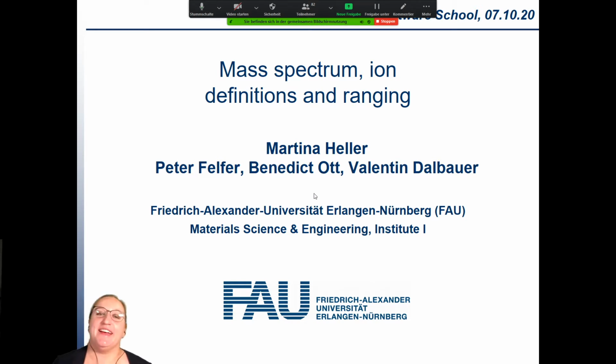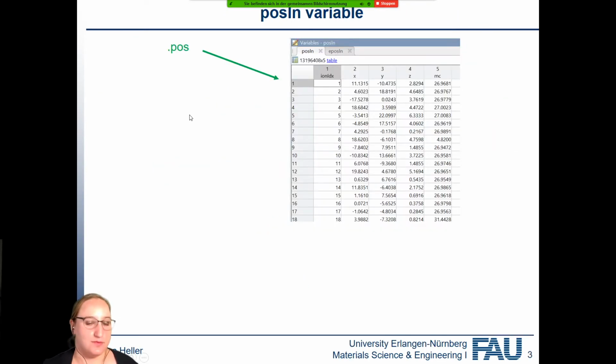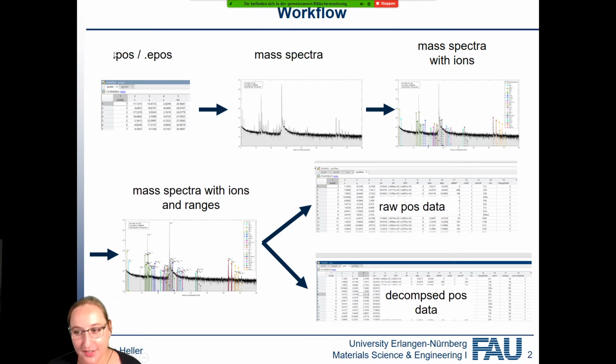Okay, so now, let's start. So you start with a POS or an EPOS file. So in general, you don't need an EPOS file. It's just depending on what you want to do with your data. You can also load in a POS file.